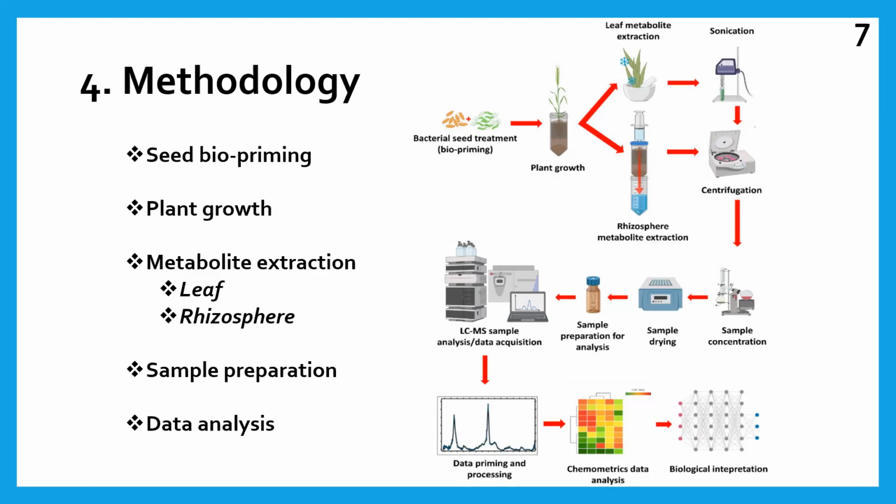You can use either one. I remember Dr. Mhlongo did the other one in his own PhD, where he would inject the formulation of the PGPR into the soil. But we figured seed biopriming was as close to the seed as we can get as far as applying the PGPR is concerned.